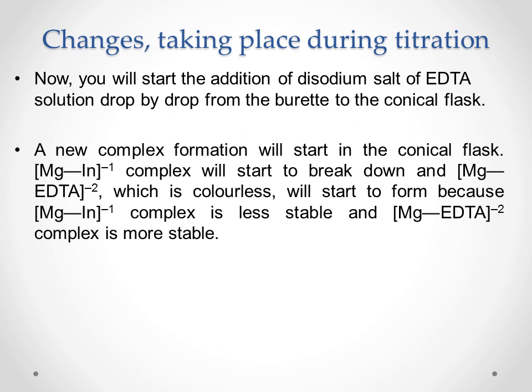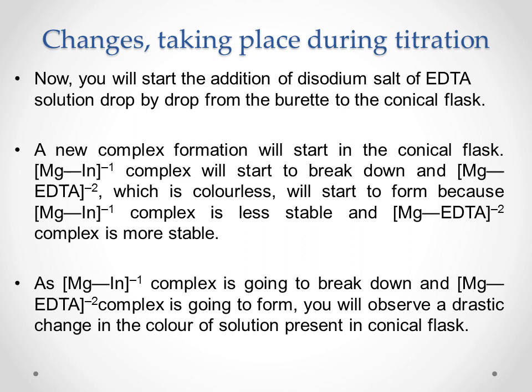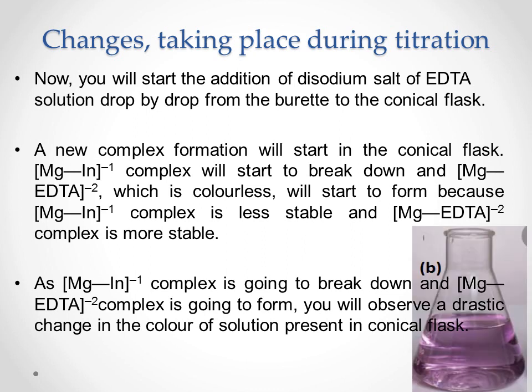equation in the previous slide, where magnesium indicator complex was pink red in color, magnesium EDTA was colorless, and as magnesium indicator complex is going to break down, magnesium EDTA complex is going to form. So you will observe a drastic change in the color of this solution present in the conical flask.